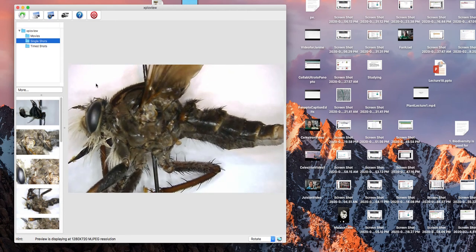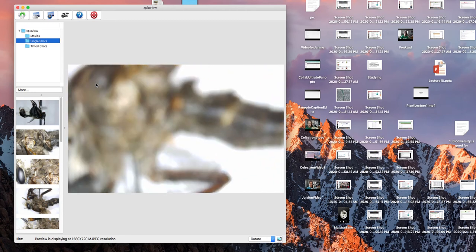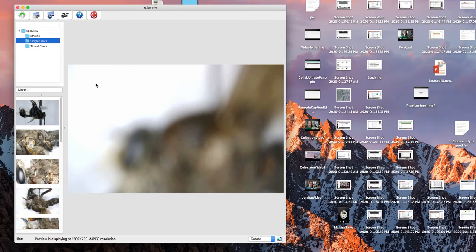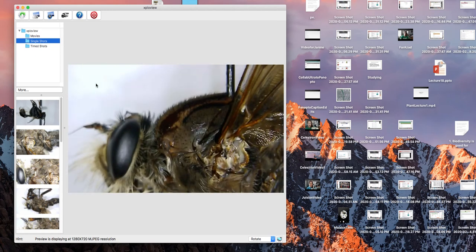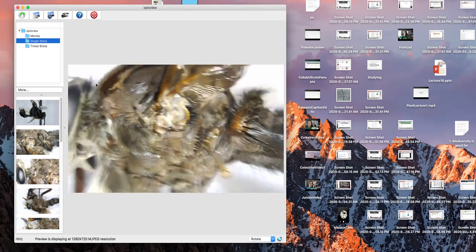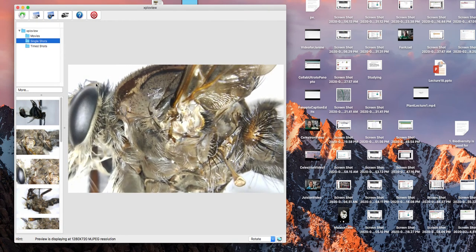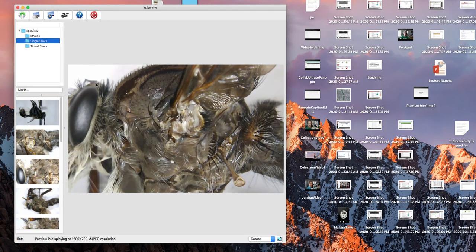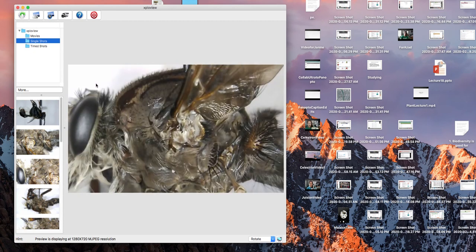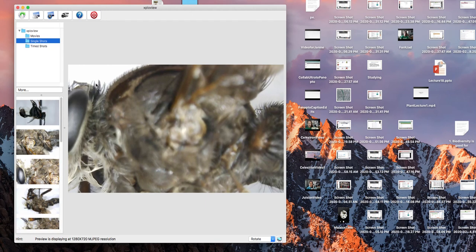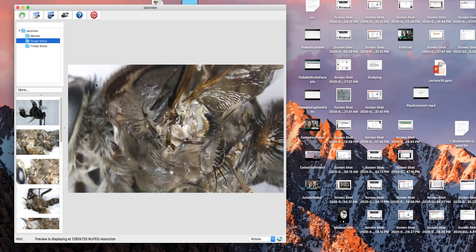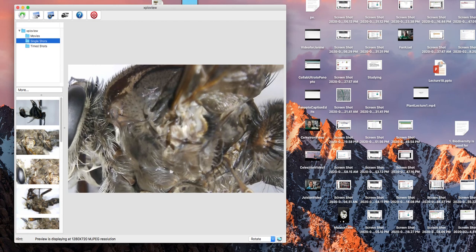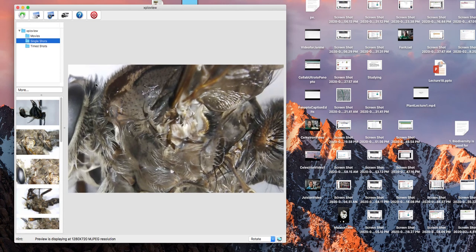So now we're going to zoom in on this. I'm bringing the head and the stage down closer. It's obviously getting brighter. You do want to adjust for your light. Going out of focus. And I'm continuously impressed by how good these tiny little USB microscopes are at getting high levels of detail in a rather large insect. So it's a little bit too bright here. I'm going to knock down the color some. Certainly you could do any amount of post-processing that you want to. Let's try to get it a little bit closer. Again, I'm starting to run into the clay where my insect is actually mounted. If I had longer pins, I could probably not worry about that. But again, that plastic ring is still going to interact with the pin that your insect is in.